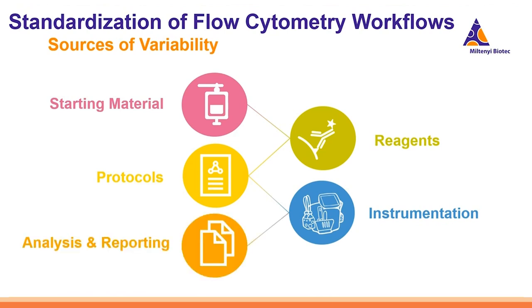And finally, when it comes to analysis and reporting, we want to have a standardized gating approach with different flow and control. As I mentioned, flow cytometry is subjective, especially when it comes to where to place gates. So we want to minimize variability in operator-to-operator bias in gating, or even things like compensation that are a little more technical and can introduce more variability.